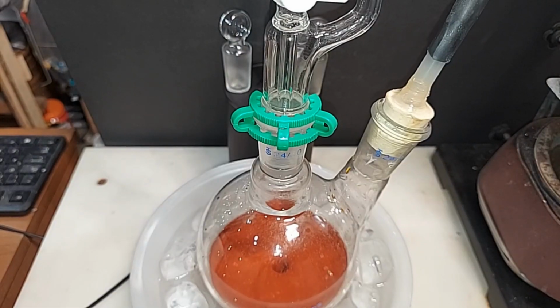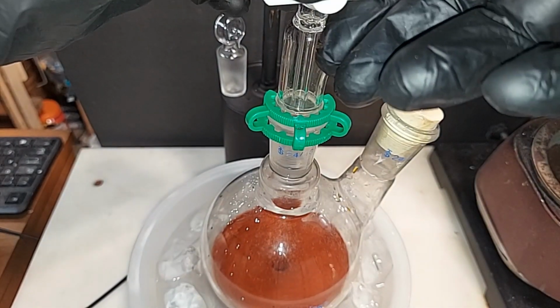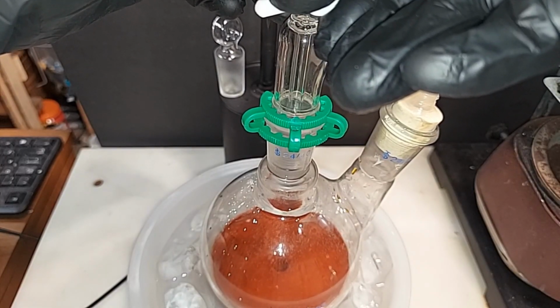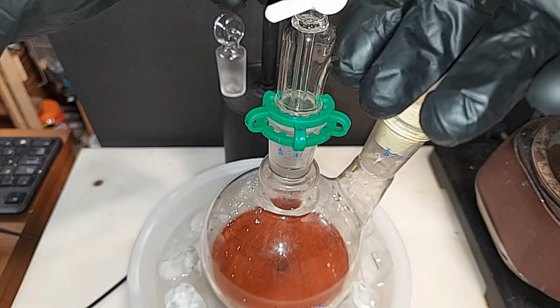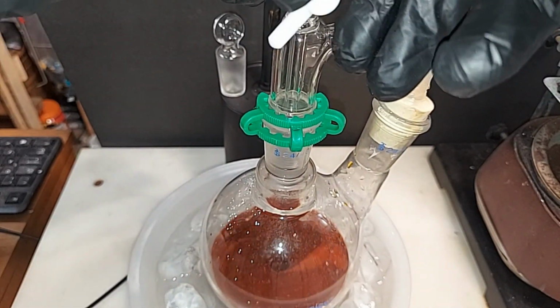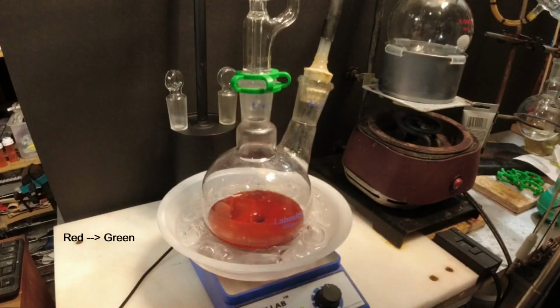I've let this mix for 2 hours now. I think it's as well mixed as it's going to get, and it's time to start adding the methanol. I'm going to slowly open the stopcock here. We want a slow drip rate. This is also exothermic, and even after it's all done being added, I'm going to mix it for another couple hours. Okay, like one drop every 5 seconds. You can see some of the swirling that's occurring there already. I will be back periodically.